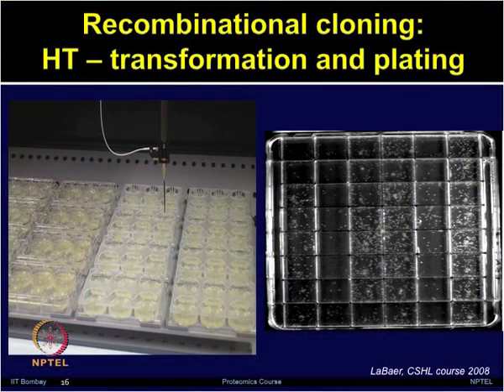The development of a 48 sector plate actually supports the plating of 96 transformations on 2 plates instead of 96 petri dishes. In the low throughput way, or conventionally, labs use a single plate for each transformation. So, if you have 96 clones and you want to do these transformations in 96 plates, handling all those plates, labeling those and storing, identifying the right clones, all of that becomes very tedious.